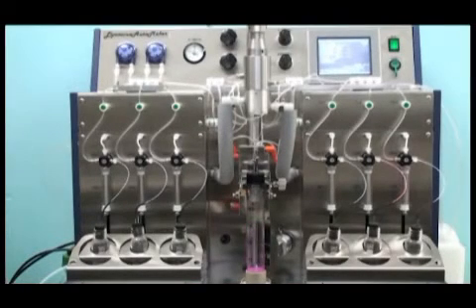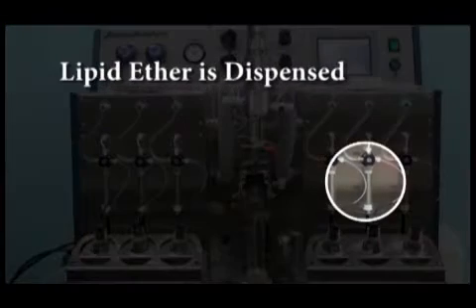The automatic processing steps of the automaker as it prepares large unilamellar vesicles are as follows. First, the automaker dispenses the lipid ether into a test tube.